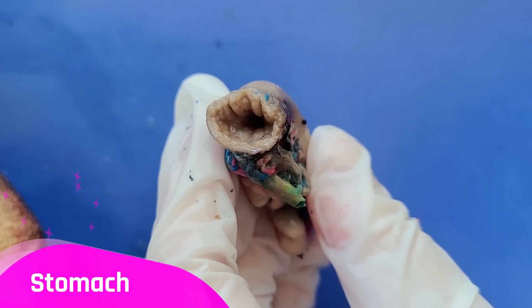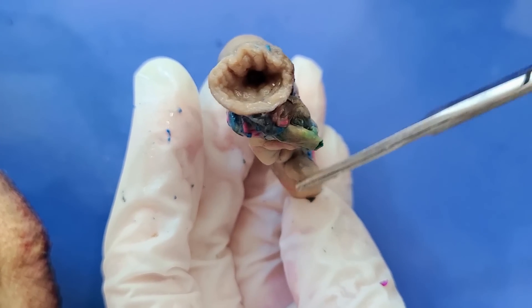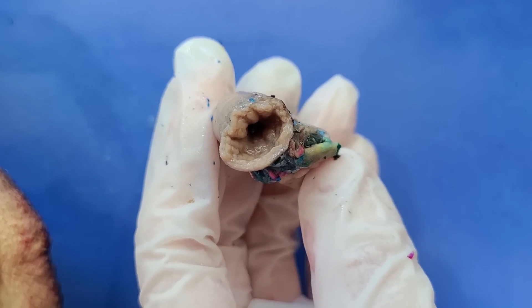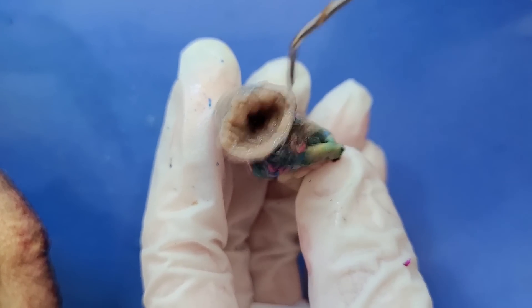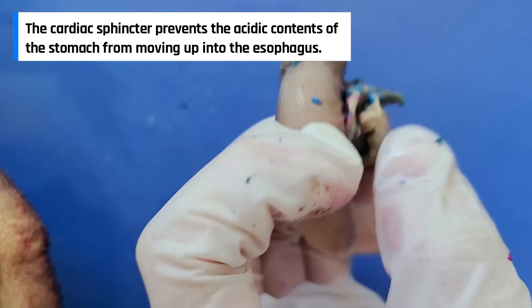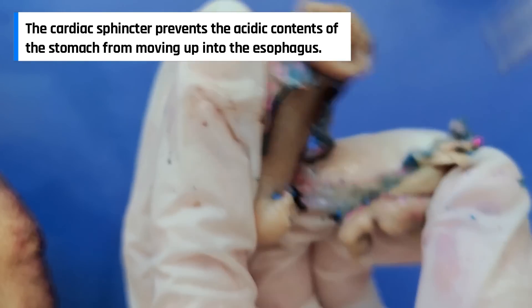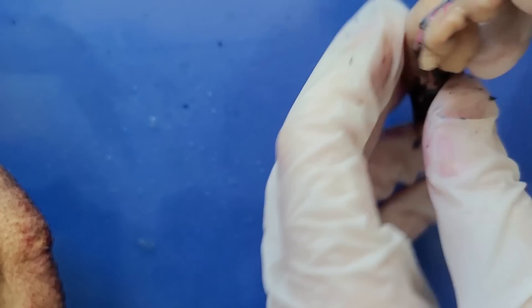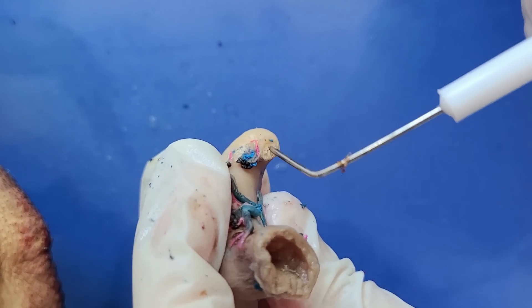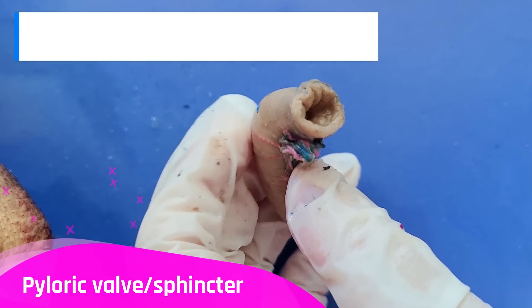So now I've cut out the stomach and you can see how the esophagus comes in and leads out into the intestine. You can also see the valve that separates the esophagus from the stomach — a ring of tissue pinches in here, and this is called the cardiac valve. Then there's another valve, much tighter, that leads into the small intestine. This is called the pyloric valve.